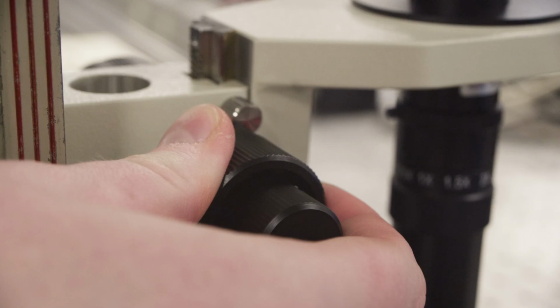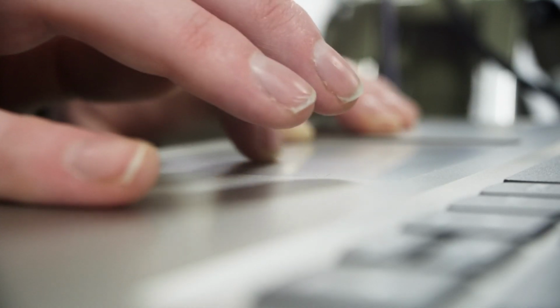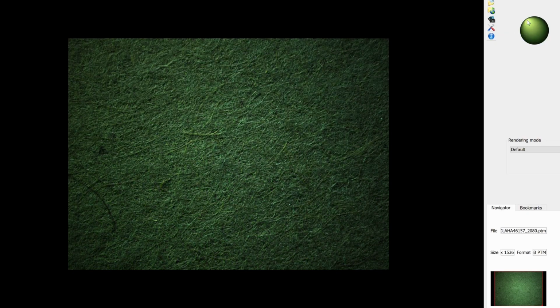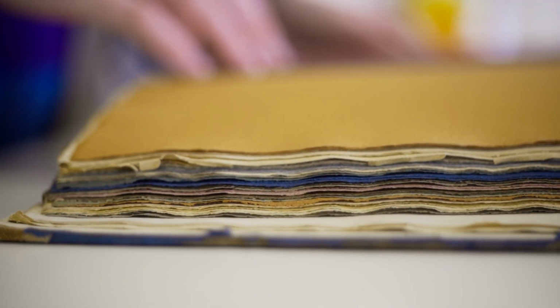And the last technique that we've used is reflectance transformation imaging, RTI. Essentially, it's a little dome that has a lot of different light sources, raking light from a lot of different angles that you can then digitally manipulate, so you can see what the surface looks like from all of these different angles. So what we do is we go from large to smaller with the analysis to get it as detailed as we can, and that is then supported by reconstructions to better understand what we're actually looking at.